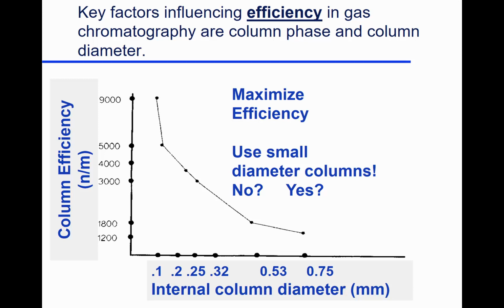And so if we look at how do we get our best separation, how do we get up here? Use tiny columns, very, very small diameter columns. The wider the column, the fatter the column, the poorer our separation. So if we want separation, we really want fine columns. That comes at a cost to us because with very, very small columns, we can't put much material on them. They would simply flood. You'd flood that stationary phase and your separation would become very poor.